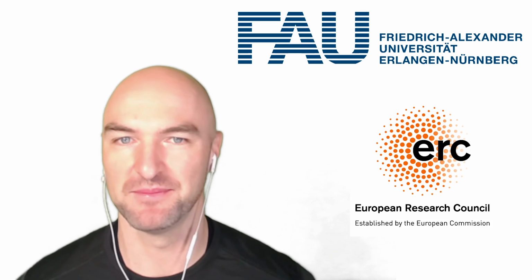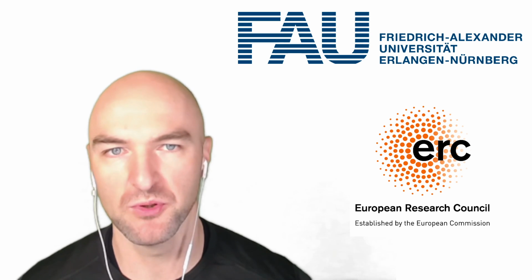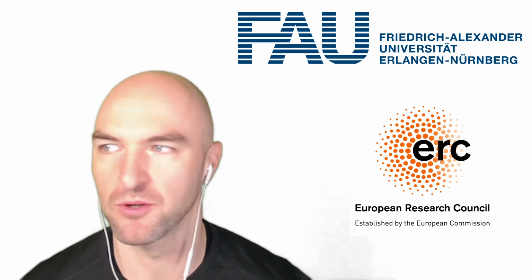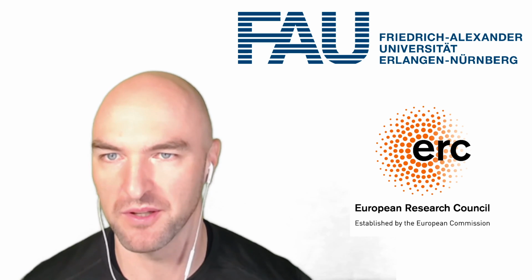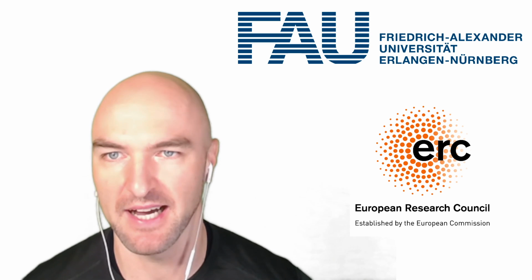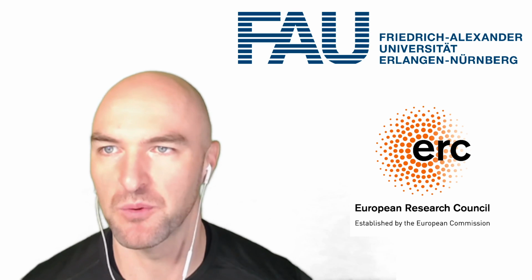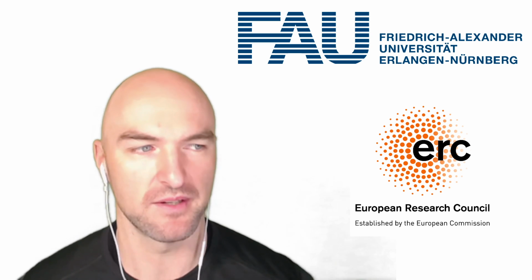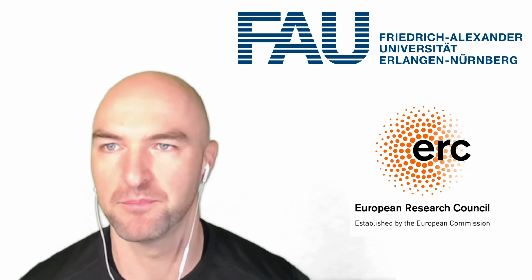Okay, so with that, let's get started with our Atom Probe analysis. Installing the Atom Probe Toolbox is actually very, very easy. All you need to do is double click on the Atom Probe Toolbox icon, and your add-on manager will come up with a window asking if you want to see the getting started guide. Yes, we want to see that, because I will just quickly talk about it. And then we have the Atom Probe Toolbox installed. It says version 0.9 because we still will do a little bit of bug fixing, but everything is pretty stable already by now.